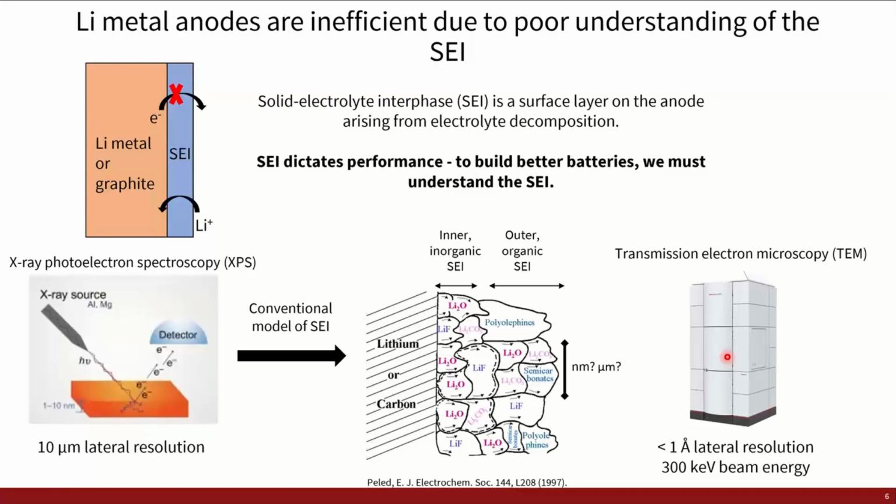We do have a K3 IS recently installed at Stanford on our analytical microscope. We've done some work characterizing different battery materials using the K3 IS with low dose, and there should be some interesting work coming out soon from Stanford looking at those materials with the dose fractionation capabilities on the K3 IS.